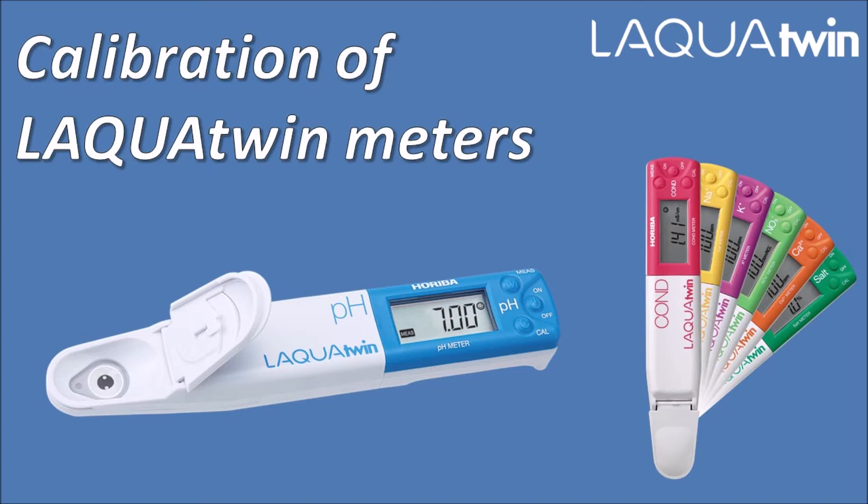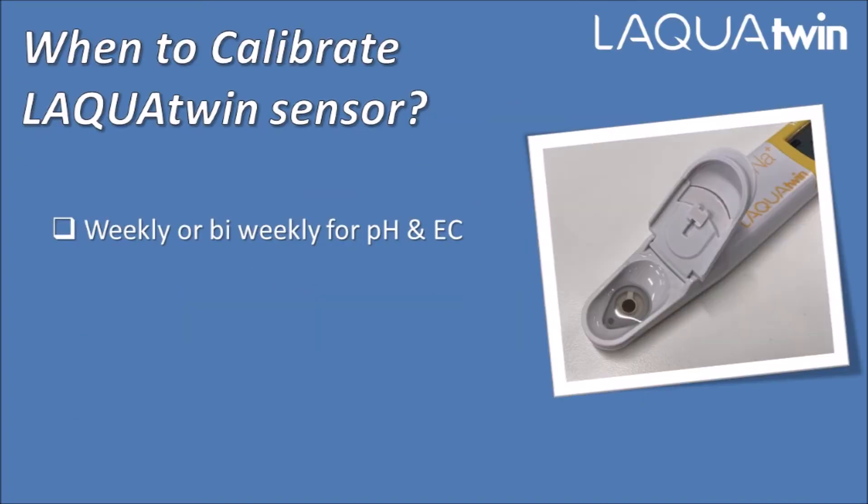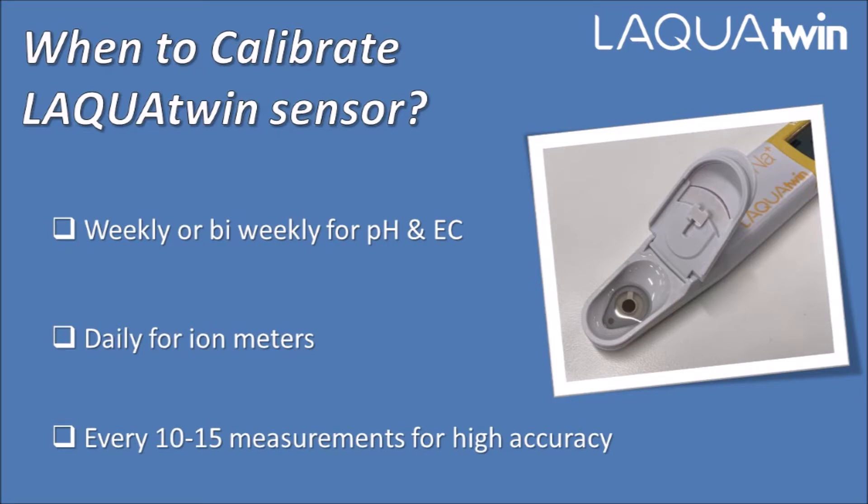Laqua Twin calibration consists of setting two reference points to achieve precision in the measurement. When should you calibrate the Laqua Twin meter? Laqua Twin pH and conductivity meters should be calibrated every week, while ion meters should be calibrated every day before use. For multiple measurements in a single day, calibrate every 10 to 15 measurements to get the highest possible accuracy.